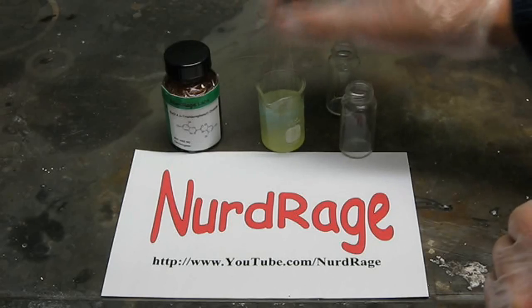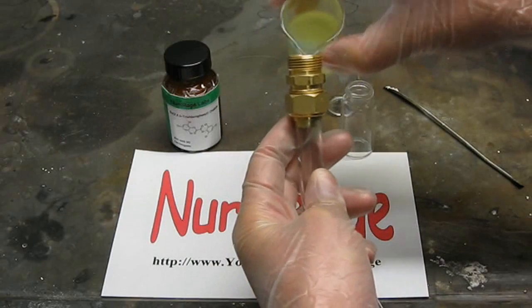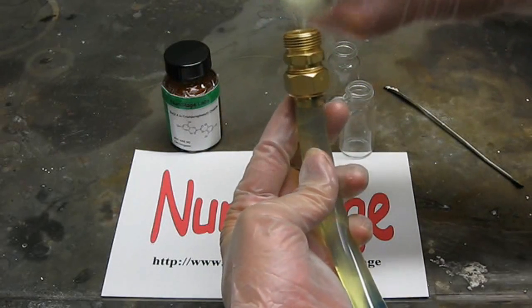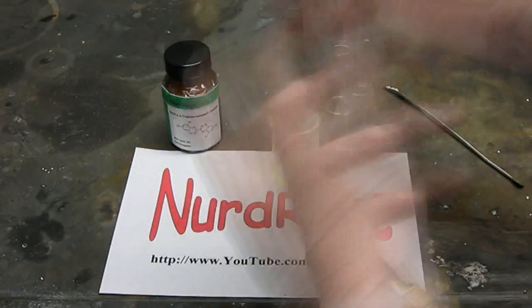A perceptive viewer will notice we use a different solvent from the ethyl acetate we used in our previous videos. Although diethyl phthalate is more expensive and much harder to get than ethyl acetate, it gives a brighter and longer lasting light, which is what you want in a glow stick.